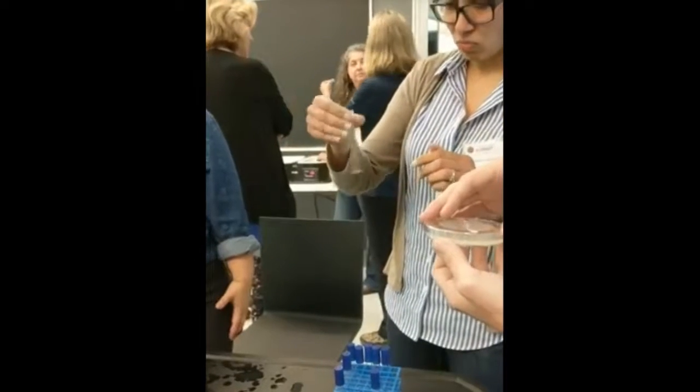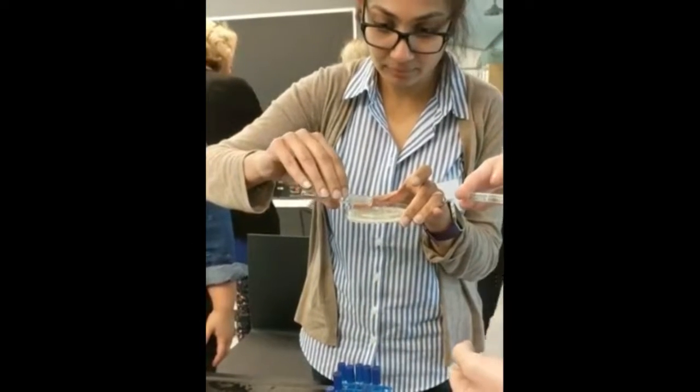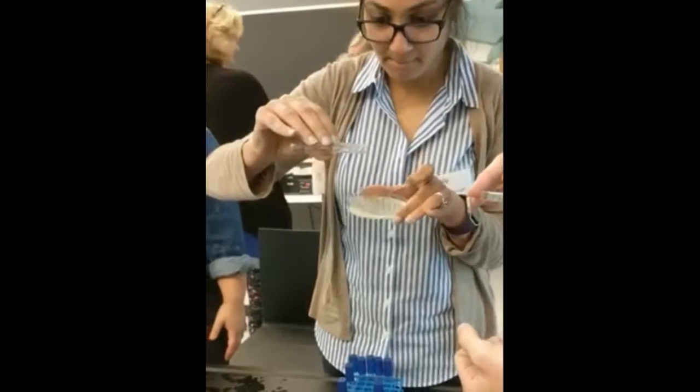Add 1 milliliter LB broth to the plasmid cell mixture that has been incubated for 5 minutes on ice. Pipette 10 microliters of this cell suspension on the appropriate labeled LB ampicillin agar plate.